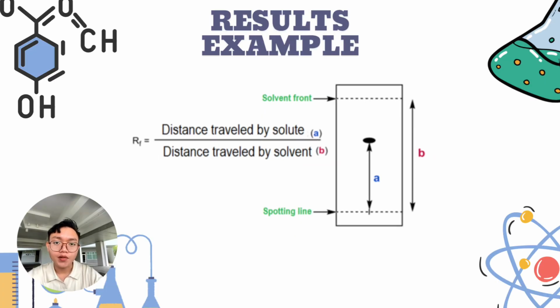So in order to calculate the retention factor in chromatography, we need to look at this formula. First of all, the distance traveled by solvent, which is labeled as B, and also on the chromatography paper shown on the photo or the slides, is on the below, whereas the distance traveled by solute, which is labeled as A, is on the above. So distance traveled by solute and solvent respectively.